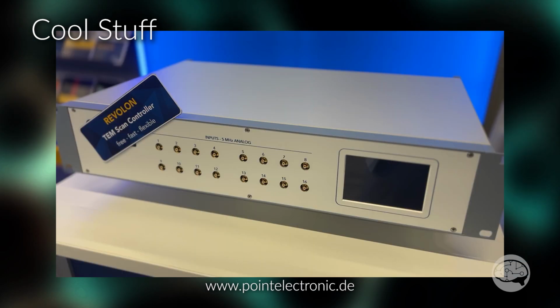Point Electronic, who have the best knobs in the business, have just come out with a TEM scan or STEM scan controller. They said they had received a huge response from customers at the conference about it, mainly having to do with its application in 4D STEM. No surprise. Apparently, most, if not all, of the big manufacturers have kind of black boxed their scan controls, making good 4D STEM results very difficult to obtain. This should allow users to more finely control their scans in the TEM or STEM for doing that 4D STEM work.